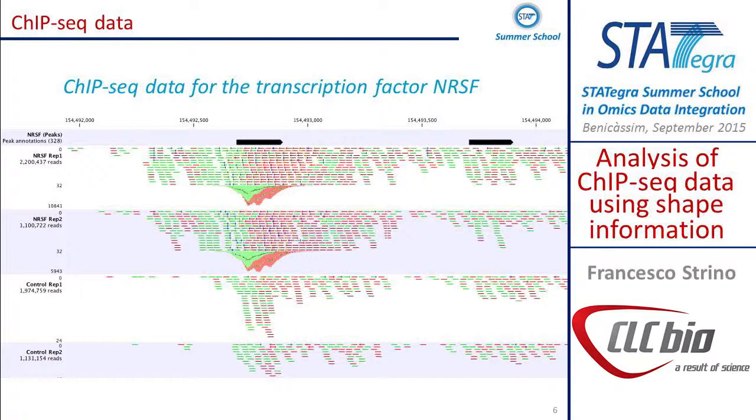So the two replicates are quite similar, and then you still have a lot of reads in the control. Those are not as high, and that could also be because when you do fragmentation, if the chromatin is open, it's easier to fragment. So it's quite common that you get this kind of profile for controls. And that's exactly why you do controls, because it's not randomly uniform distributed reads. It follows some pattern of chromatin and sequence specificity.